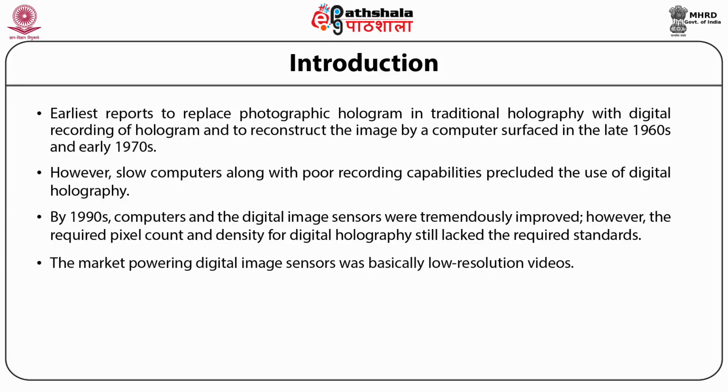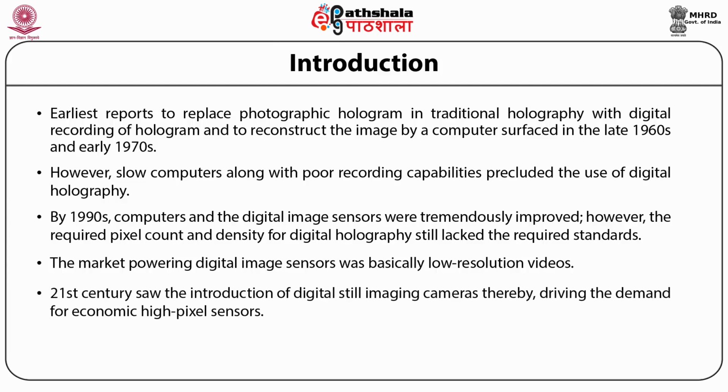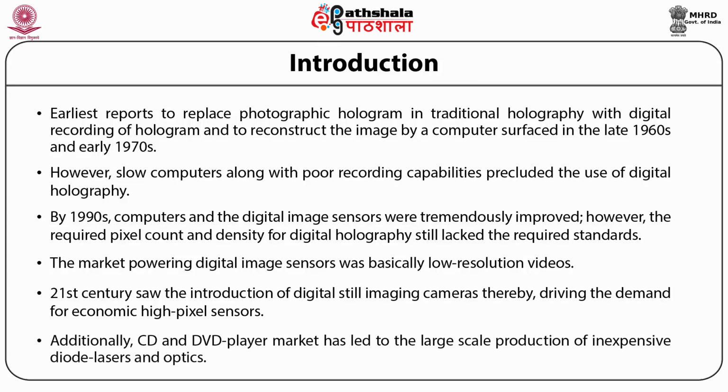The market powering digital image sensors was basically low-resolution video. The 21st century saw the introduction of digital still imaging cameras, thereby driving the demand for economic high-pixel sensors. Additionally, the CD and DVD player market has led to the large-scale production of inexpensive diode lasers and optics.